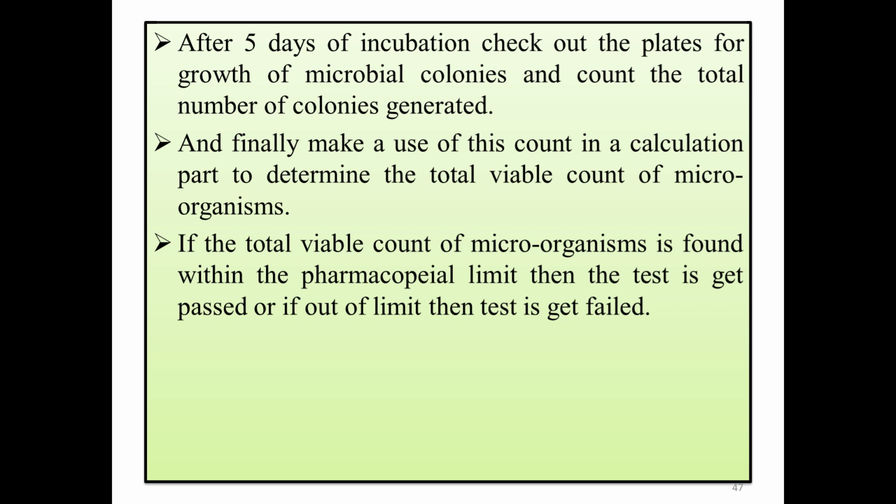Okay, if the sample lies within the pharmacopoeial range, then it is said to have passed the test. But if that sample doesn't meet the requirement of the limit which is to be present in the sample, if it is not containing the required limit of microorganisms, or if it is not in the pharmacopoeial limit, then it will fail the test. I hope you get both these methods.